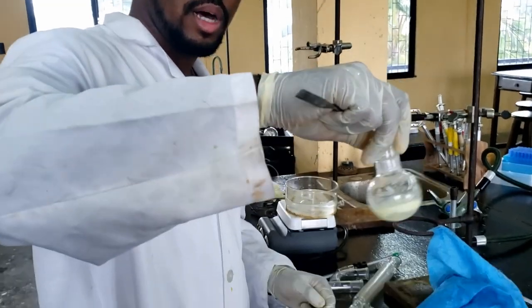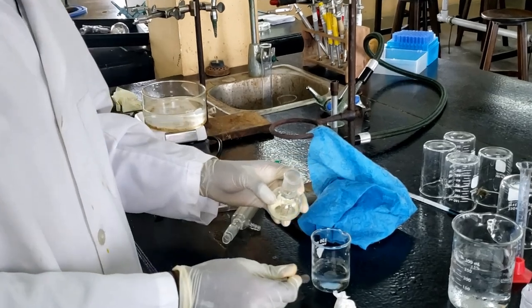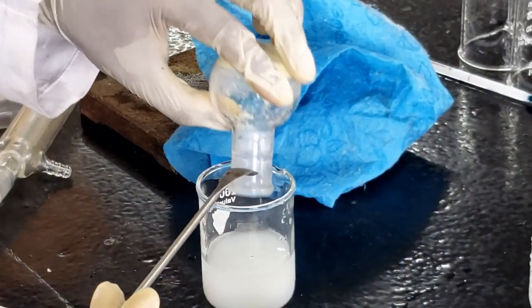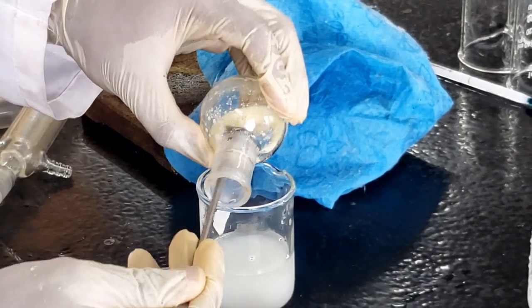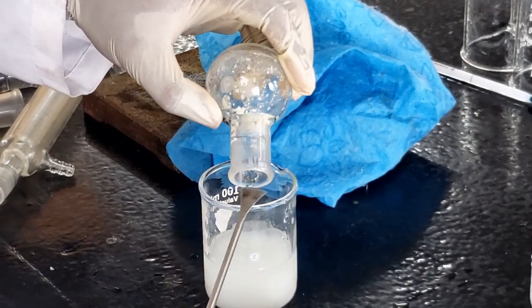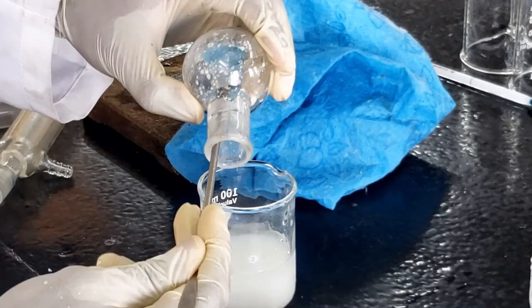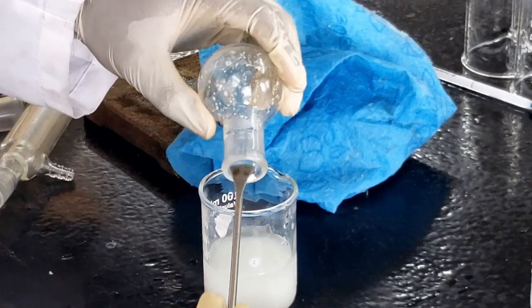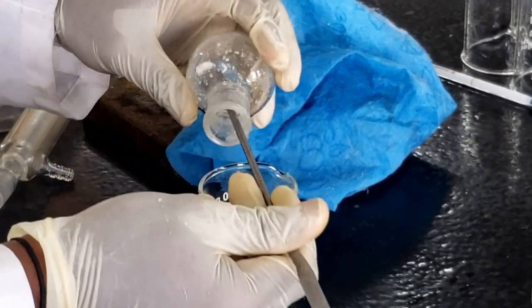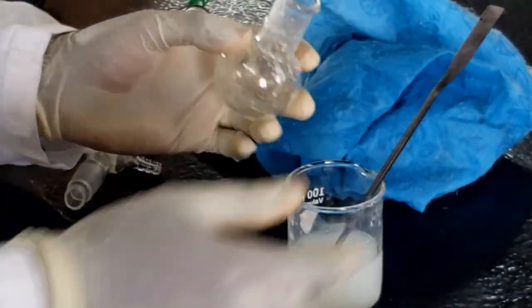We have some of the crystals all around the flask. What I'll do is add whatever remaining solution and the crystals to 40 mL of ice cold water. I'll use this scoop to scrape any of the crystals off the edge. I want to get as much as possible, and from here we're going to move on to the vacuum filtration process.